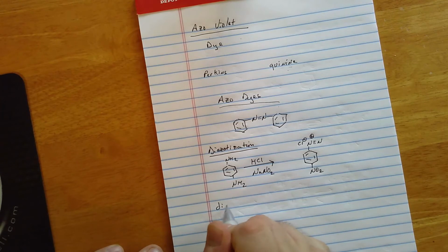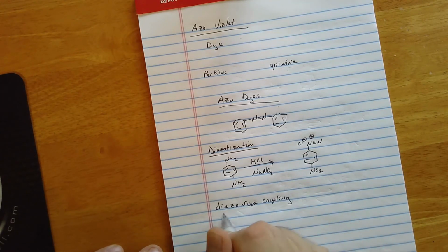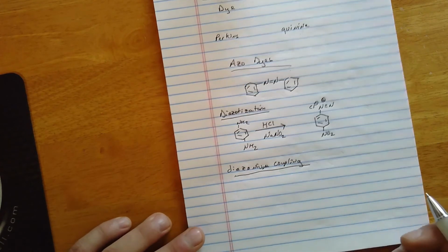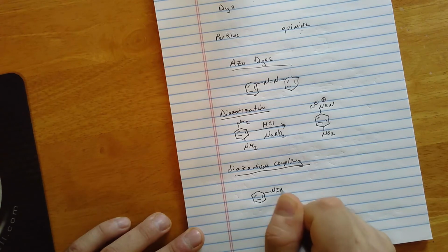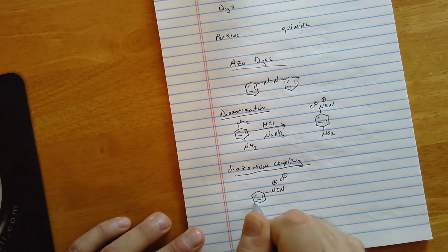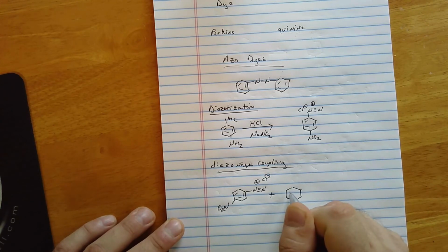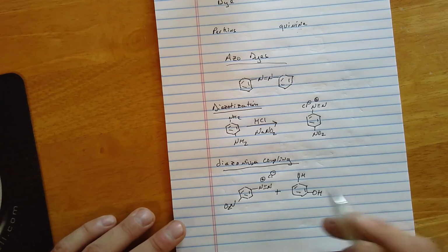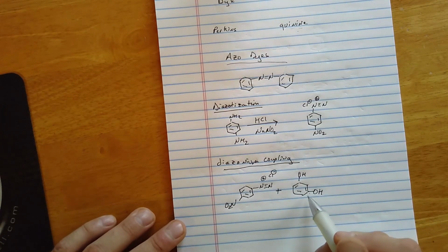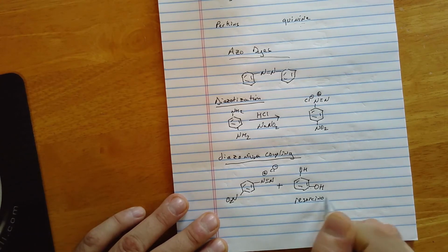Then you do the second step of azo dye synthesis, which is called diazonium coupling. In essence, this is an electrophilic aromatic substitution reaction. So we take our diazonium salt, and you add to it your second aromatic molecule, which for us is resorcinol. It's also known as 1,3-dihydroxybenzene, and it is also sometimes called 3-hydroxyphenol. So multiple names. Its common name is resorcinol.